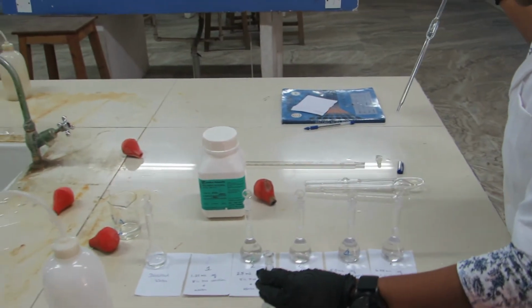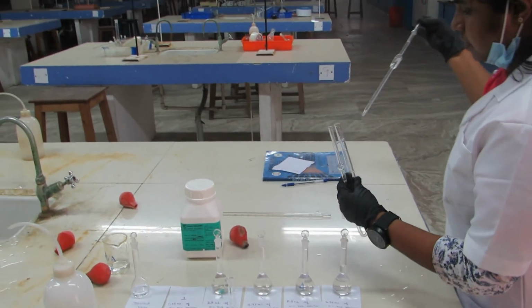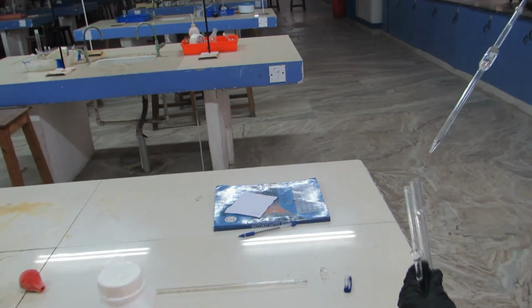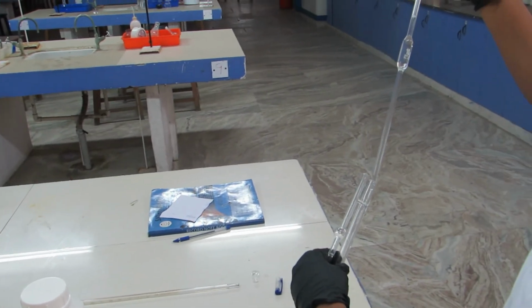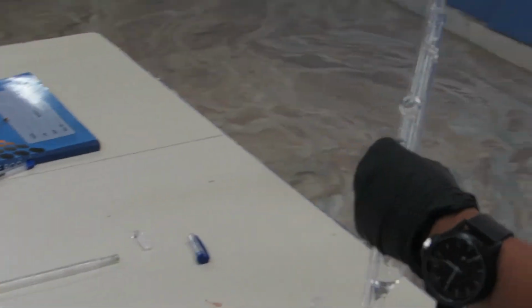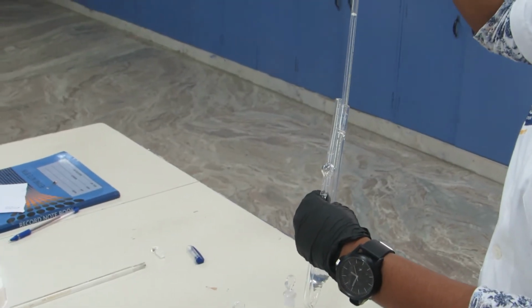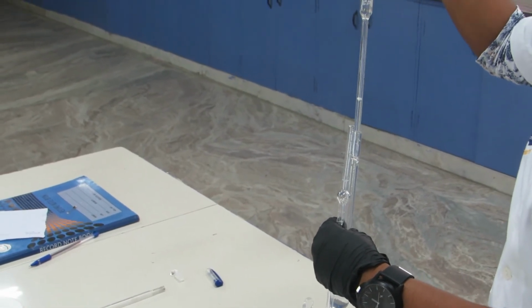You can release our 0.25% polyvinyl alcohol into the viscometer. Okay. It is better if you keep your viscometer at 45 degrees. We can avoid the formation of bubbles in the viscometer. At the end, we have to release the entire solution.